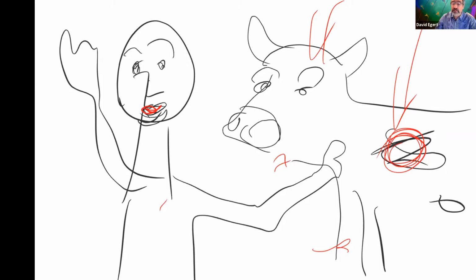So one of the things that we did this summer for you that's not part of the original protocol is we kept one of the cow bloods with glycerol and let it incubate for half an hour before we spun it down, to see the difference between just mixing it up and spinning it down versus giving the glycerol a chance. That's something you'll get to see when we look at our results today.